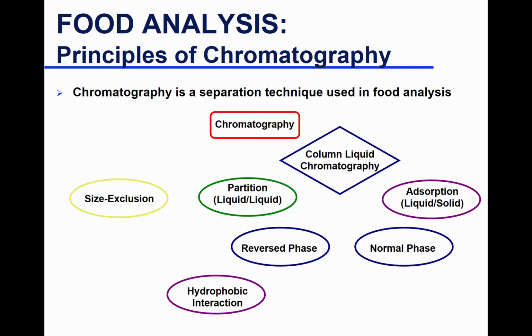There's hydrophobic interaction chromatography, which is mostly used in the protein world, for separation or purification of proteins. Affinity chromatography is based on a very specific interaction, like an antibody with an antigen or an enzyme with an enzyme inhibitor.